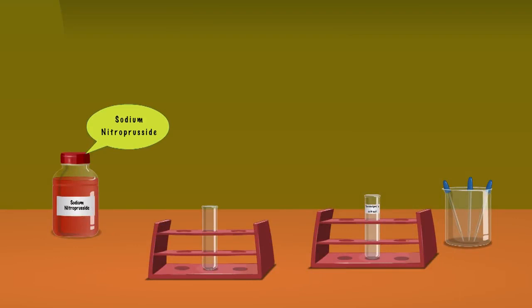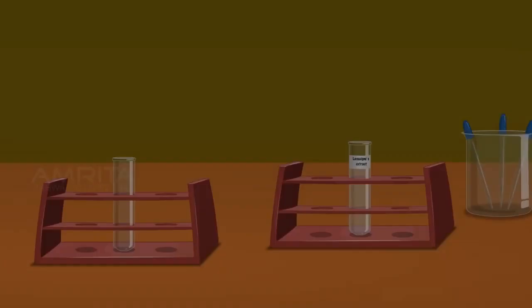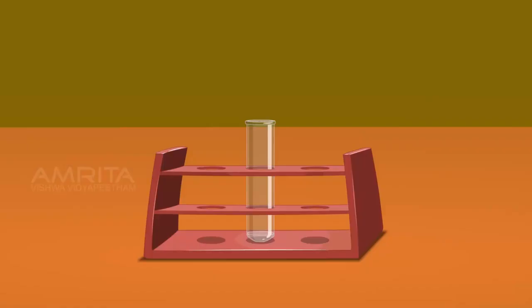Detection of Sulphur — Sodium Nitroprusside Test. We require sodium nitroprusside solution, test tube, Lassaigne's extract and droppers. Take a small amount of Lassaigne's extract using a dropper and pour it into a clean test tube. Using another dropper, take a small amount of sodium nitroprusside solution and add a few drops into the test tube containing Lassaigne's extract. The sodium sulphide formed during the preparation of Lassaigne's extract gives a purple or violet colour with sodium nitroprusside, due to the formation of sodium thionitroprusside.